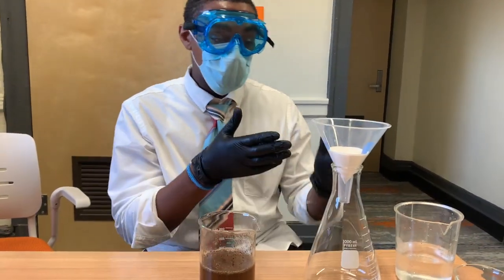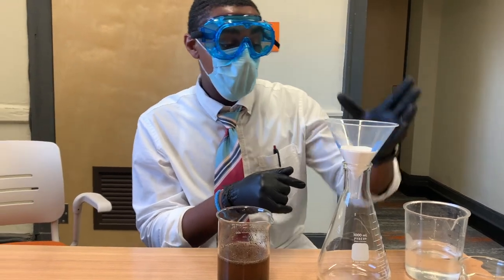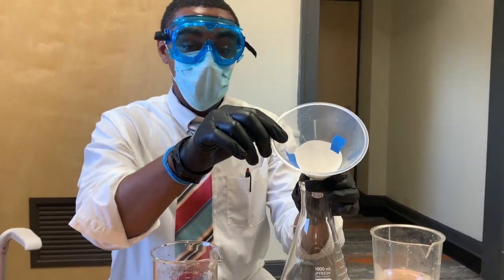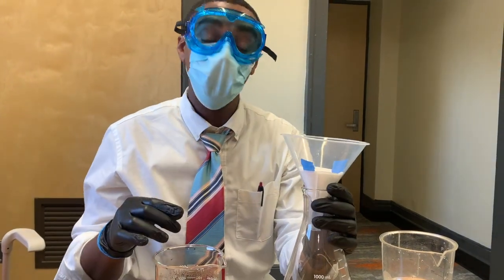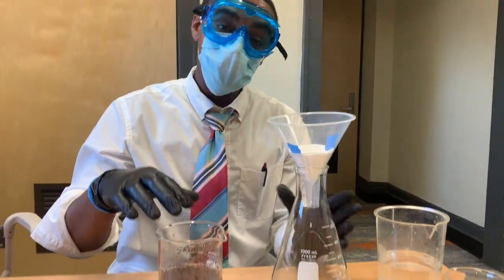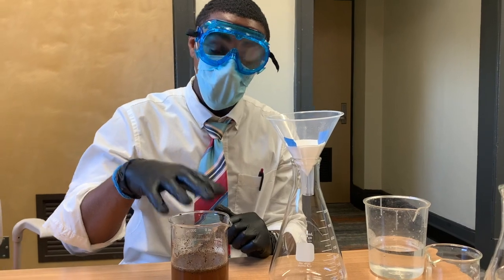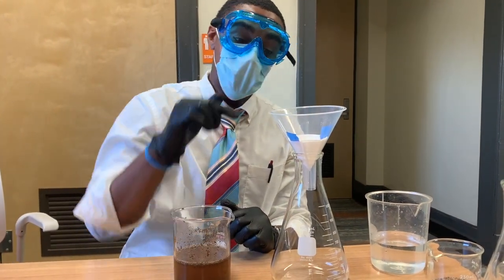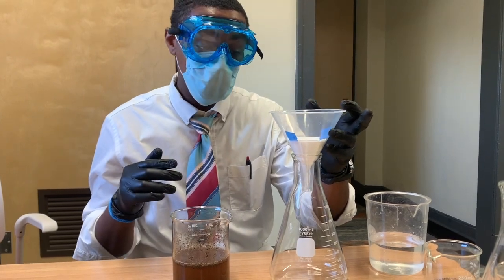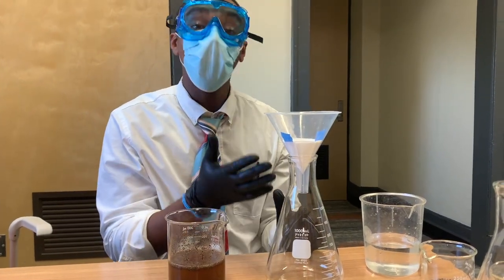Inside the filter we have filter paper, which we folded up. What's going to happen is we'll see that a lot of the contents from this beaker is going to be stuck in the filter paper. And what we should see is all the liquids just drop to the bottom. So let's get started.